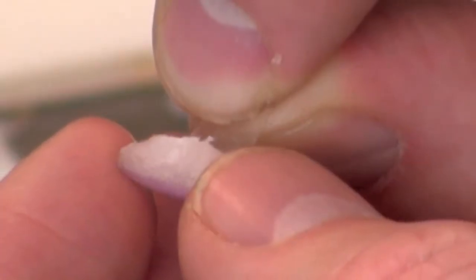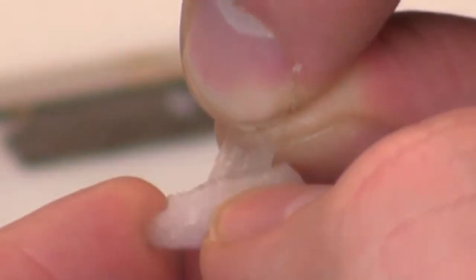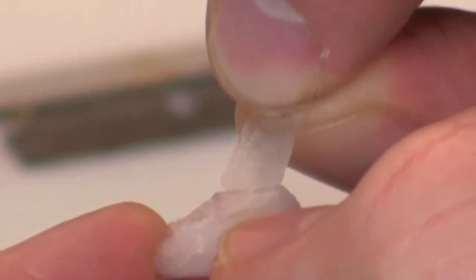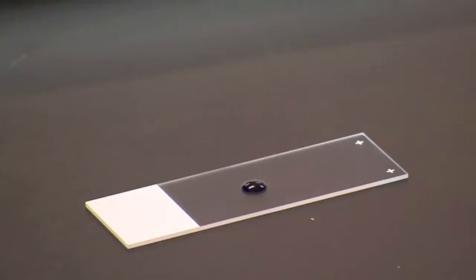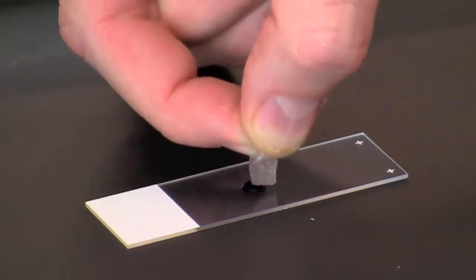Peel a piece off the inside epidermis of the onion leaf scale that is roughly one half to one centimeter squared. Place the piece onto the drop of stain on the slide.